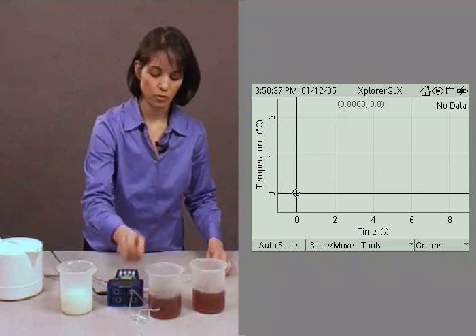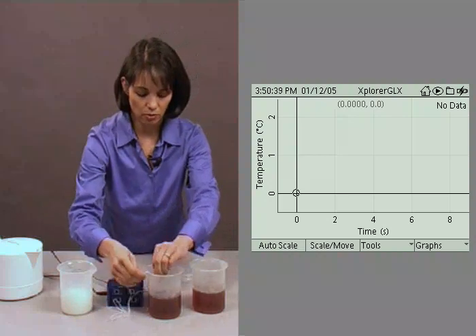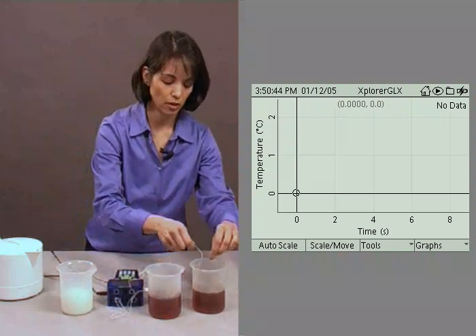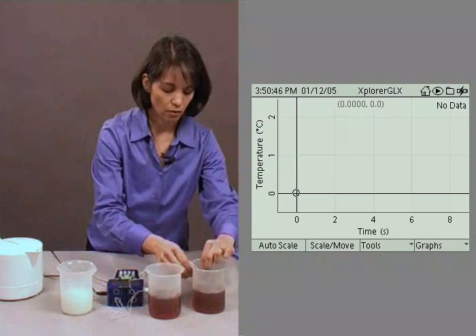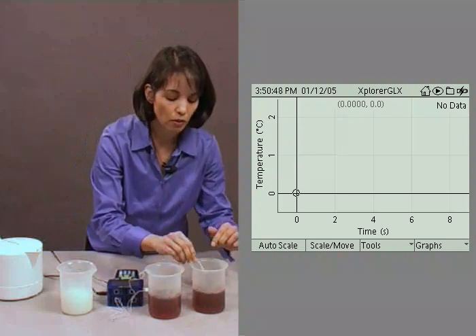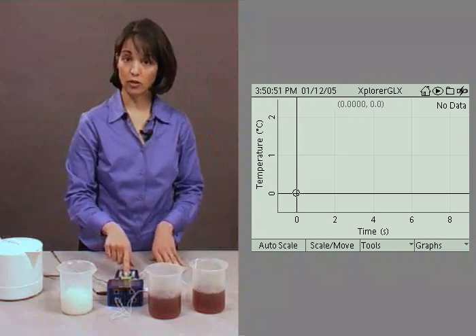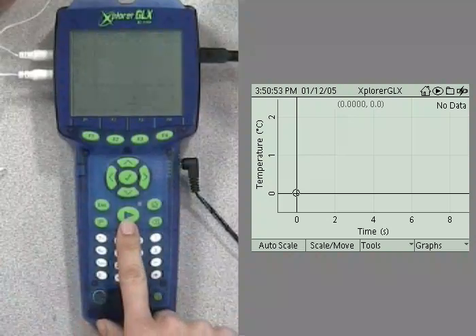And there's the other one. And then we will put our probe from port 1 into the first container. And our probe from, make sure it gets in there and stays.